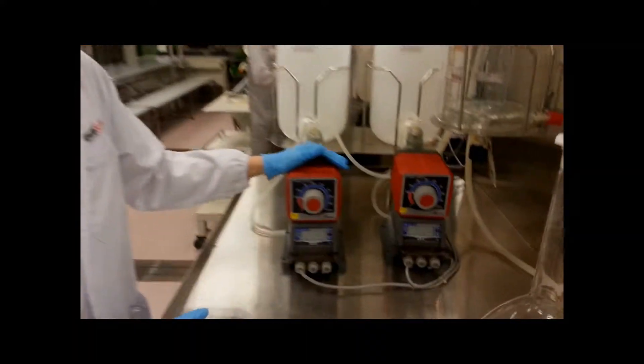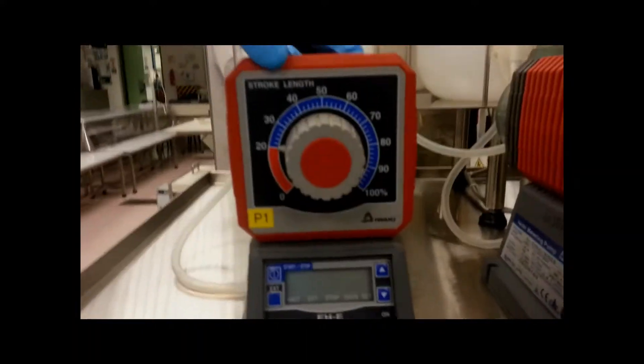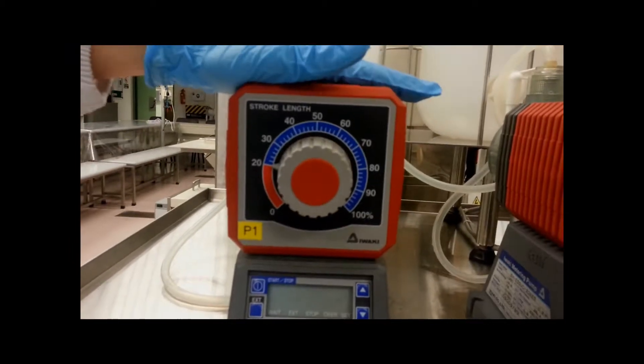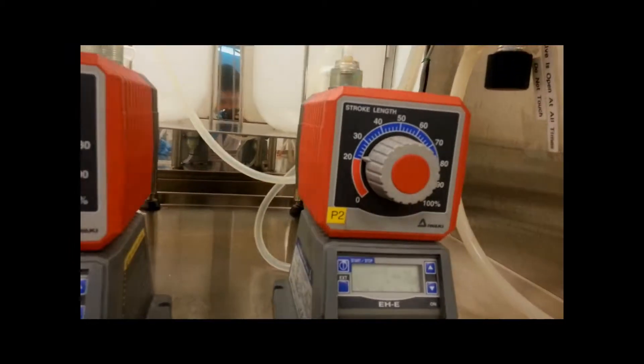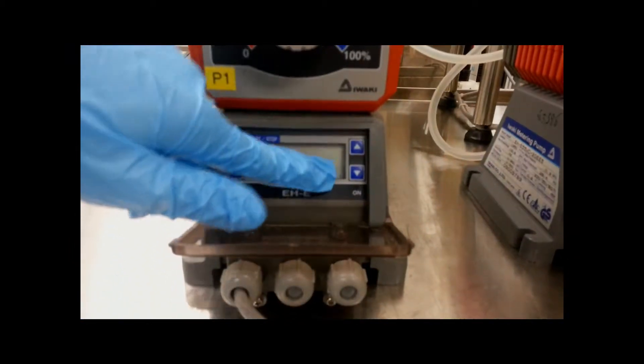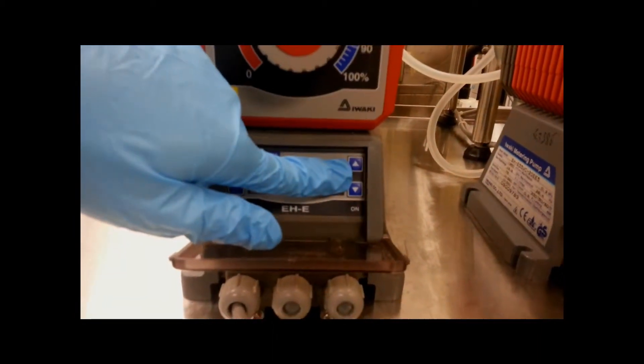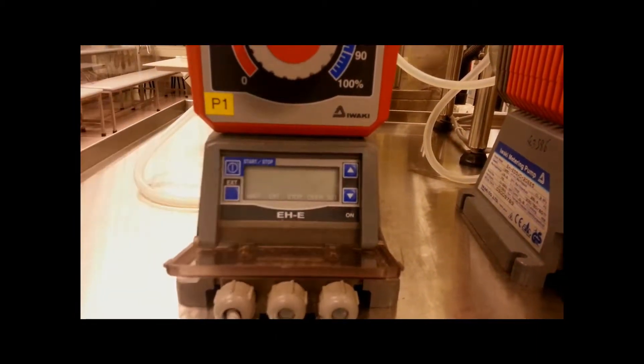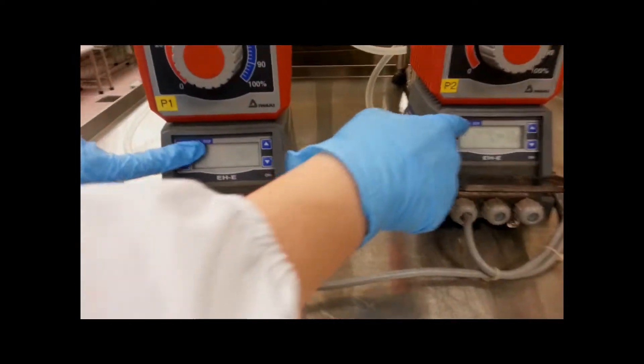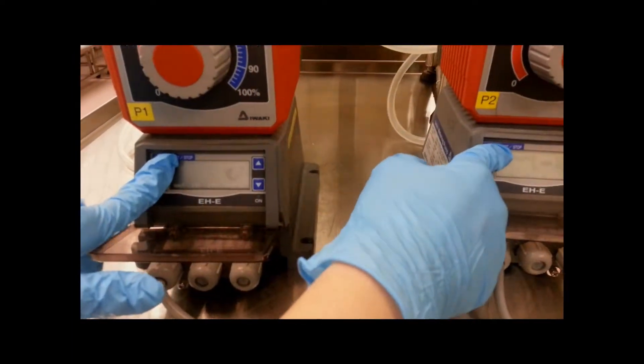Adjustment of pumps. Firstly, you turn the stroke length onto 20 for both pumps and you adjust the RPM using this button over here to 250 RPM. After which, you will be required to use both hands at the same time to turn on the pump.